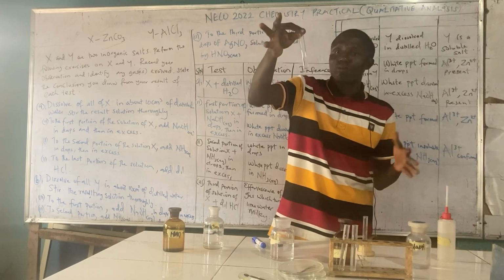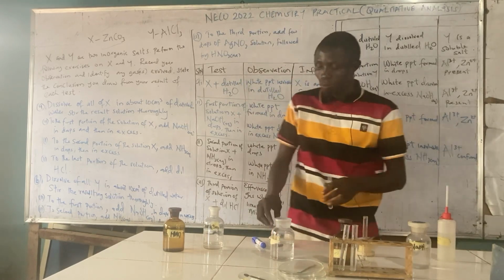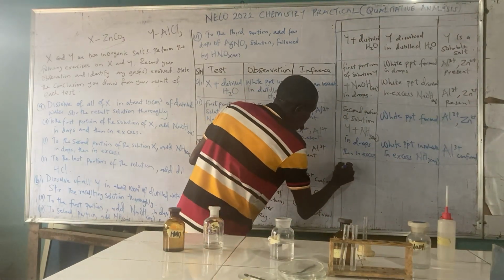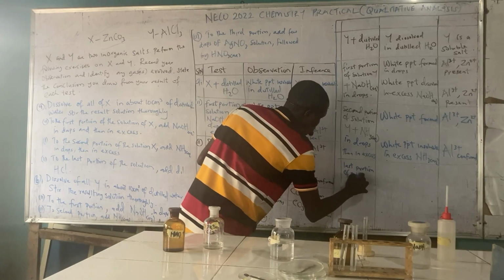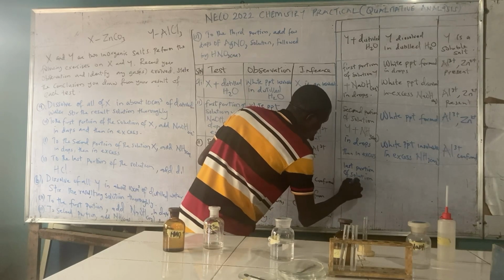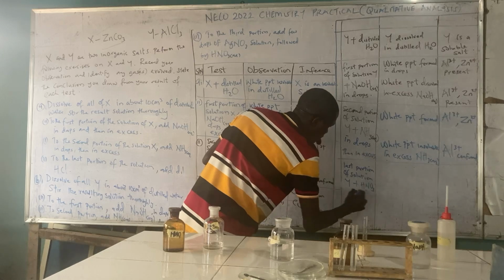Now to the last portion of this solution Y. The last portion of solution Y plus HNO3.